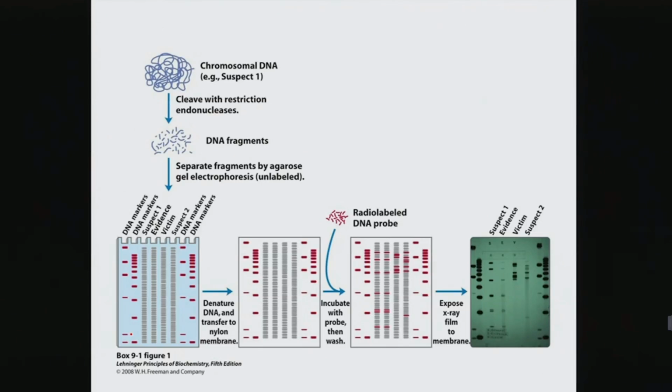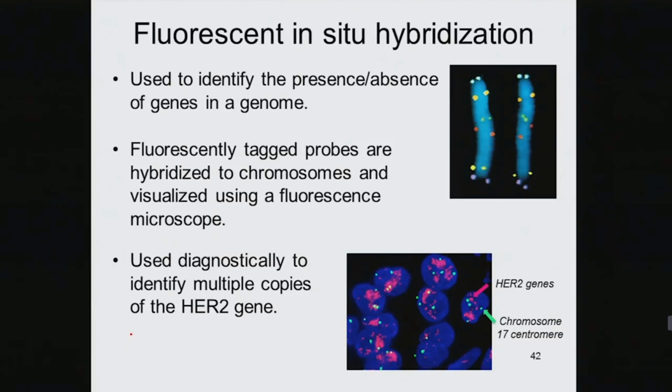Okay? So again, you can see the banding pattern is very similar to the blood that you see in the evidence, that you would actually see with the evidence undergoing these techniques. Okay, so you can use it diagnostically in forensics to carry out these types of procedures.